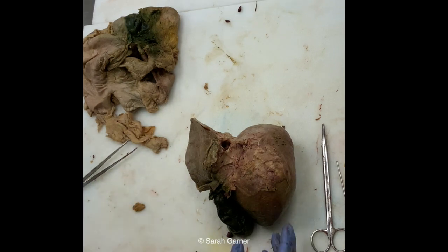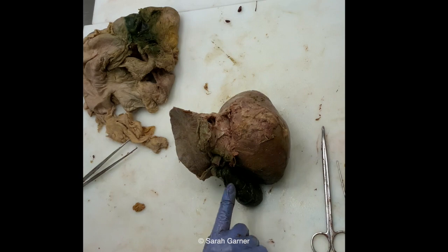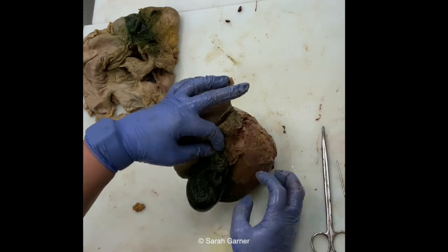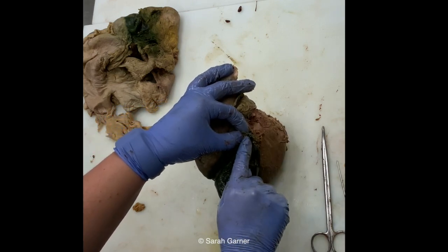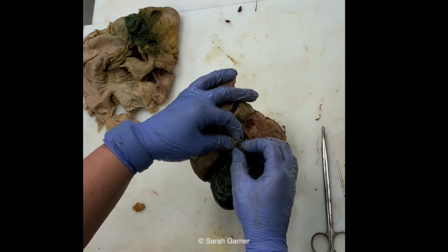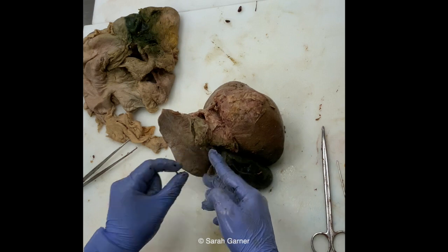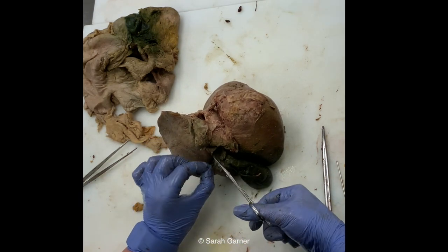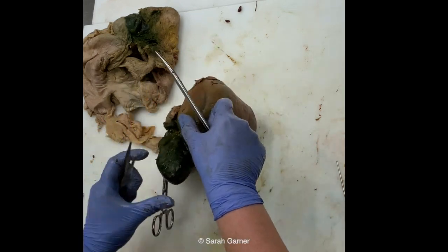So now, are we ready to weigh yet? The answer is no, because you still have your gallbladder attached. So here, you want to detach your gallbladder. Now, I would recommend first clamping it. And really, I should have probably clamped it when I first cut that bile duct, but since this is fixed, I knew it wasn't going to leak out all over me. But in reality, if that was a fresh specimen, I probably would have clamped it right before I cut. So here, I'm just going to clamp the bile duct where it's cut, and then we can remove the gallbladder.